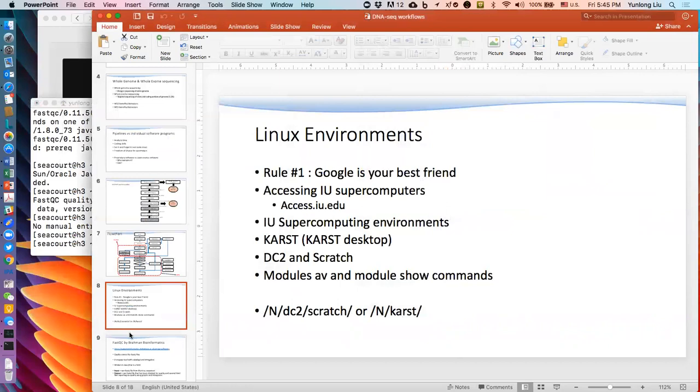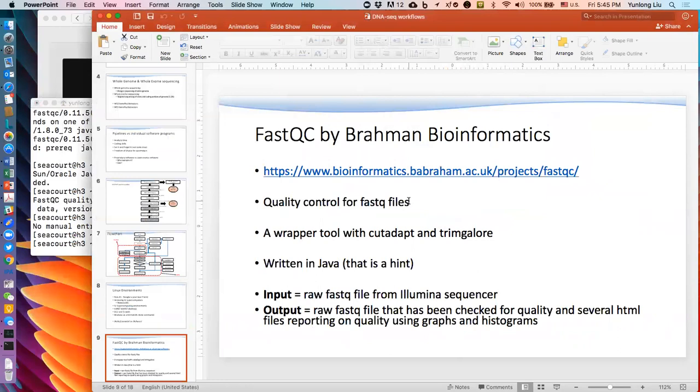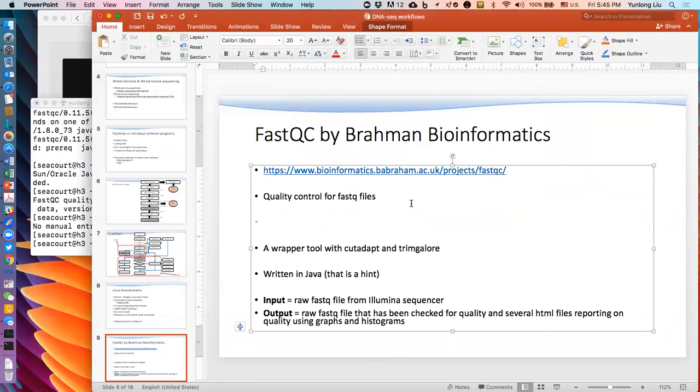So let us go to here. This is a nice spot to give you something to think about. If I were in Karst, you're telling it you're going to submit a job, okay? FastQC is your program. So the next thing it needs to know is that it's going to receive a file. But the next logical step is not only the fact that it's going to get a file, it's the type of file. So you have to come back and tell it FastQ one more time. And then if it were me, I would put my files of interest after that.